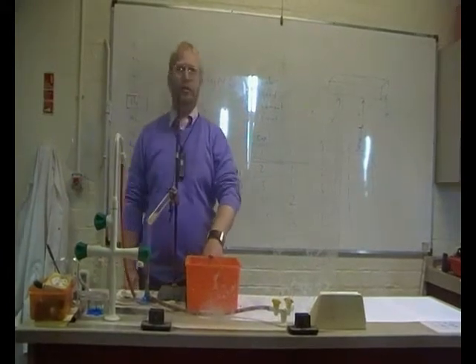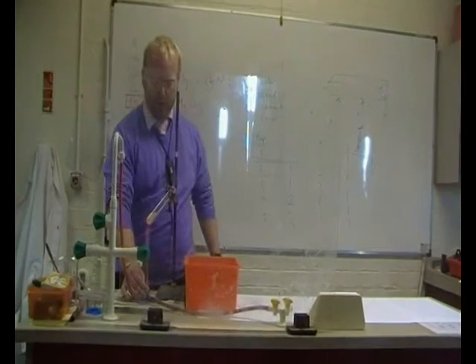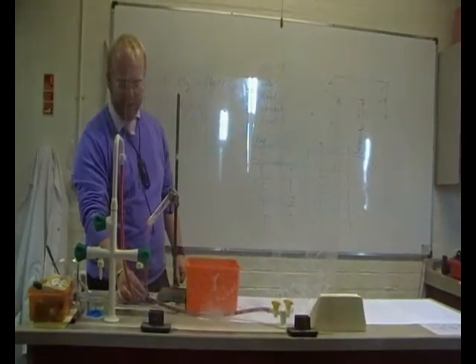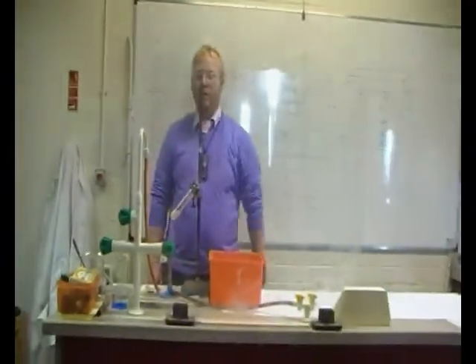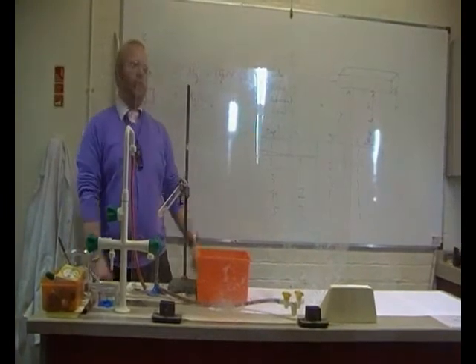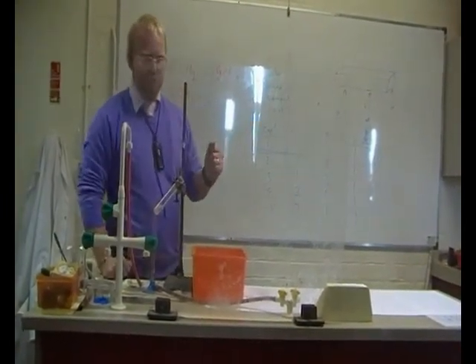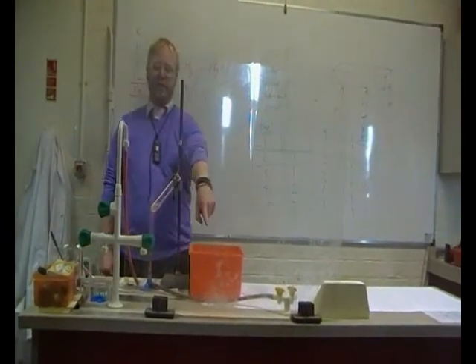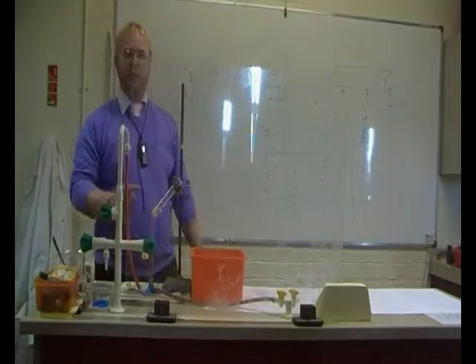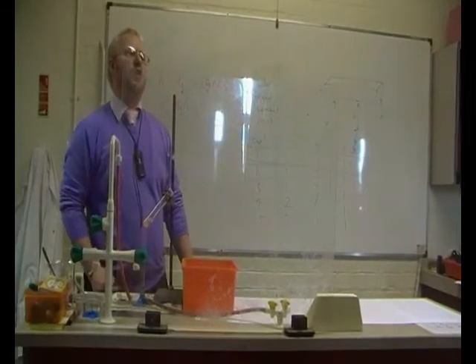What happens to the boiling tube? Smashes. Smashing, yes. What I've normally been trying to avoid. Okay, if the boiling tube smashes, if we've got cracks in it, what could get into the boiling tube? Water. Good. If you've got water inside the boiling tube, cold water touches hot boiling tube, hot wax, what will happen to the water? Evaporate.